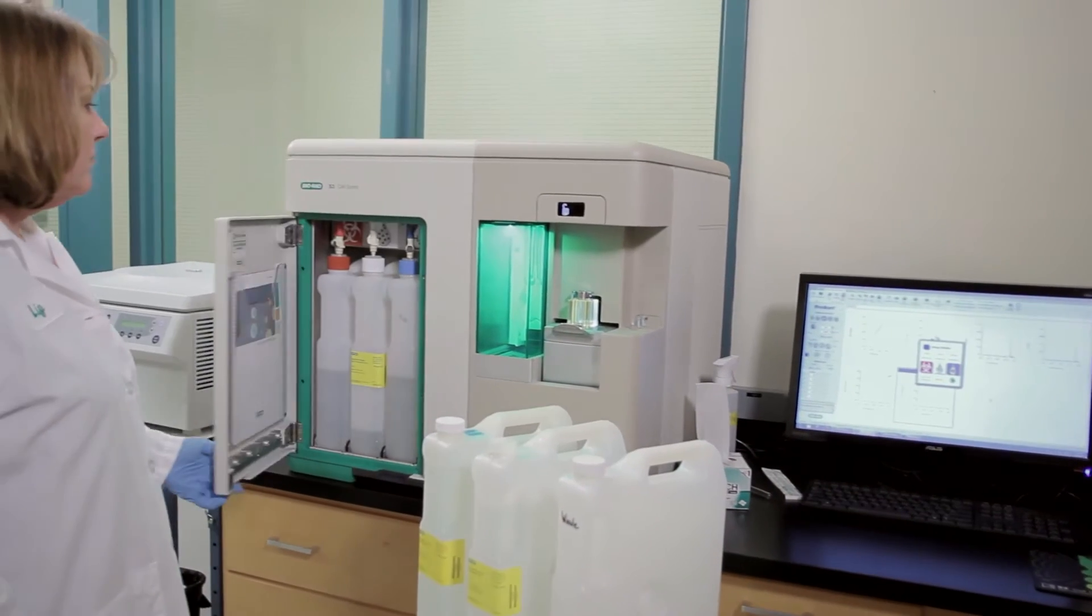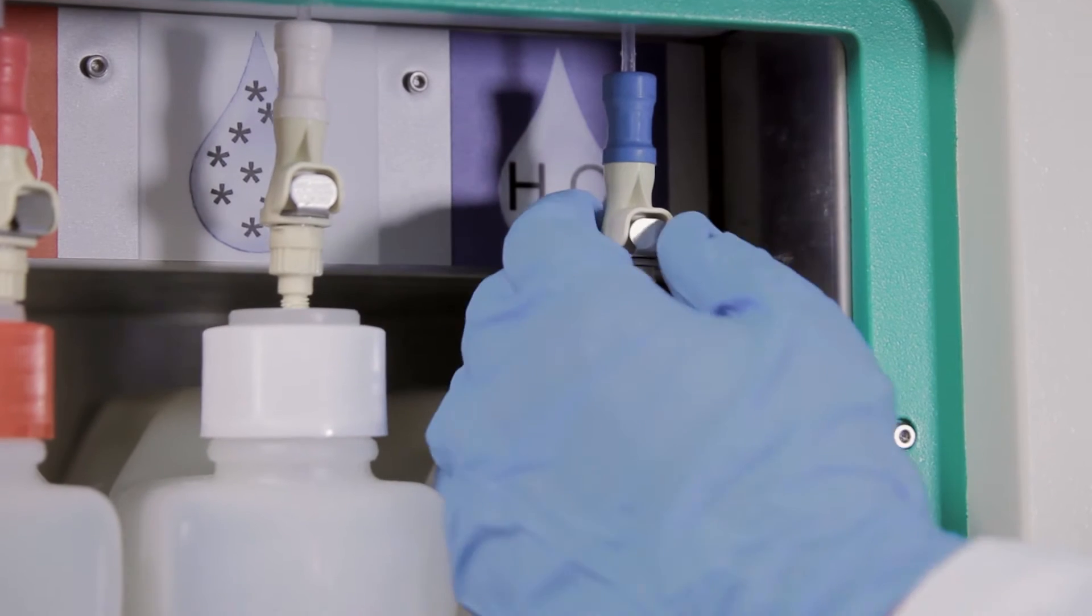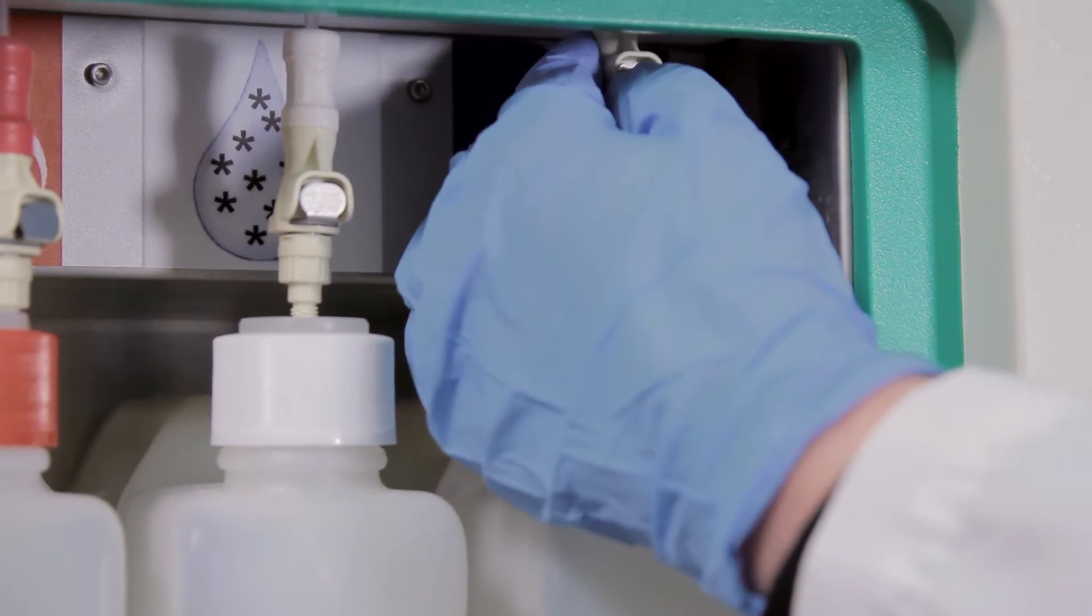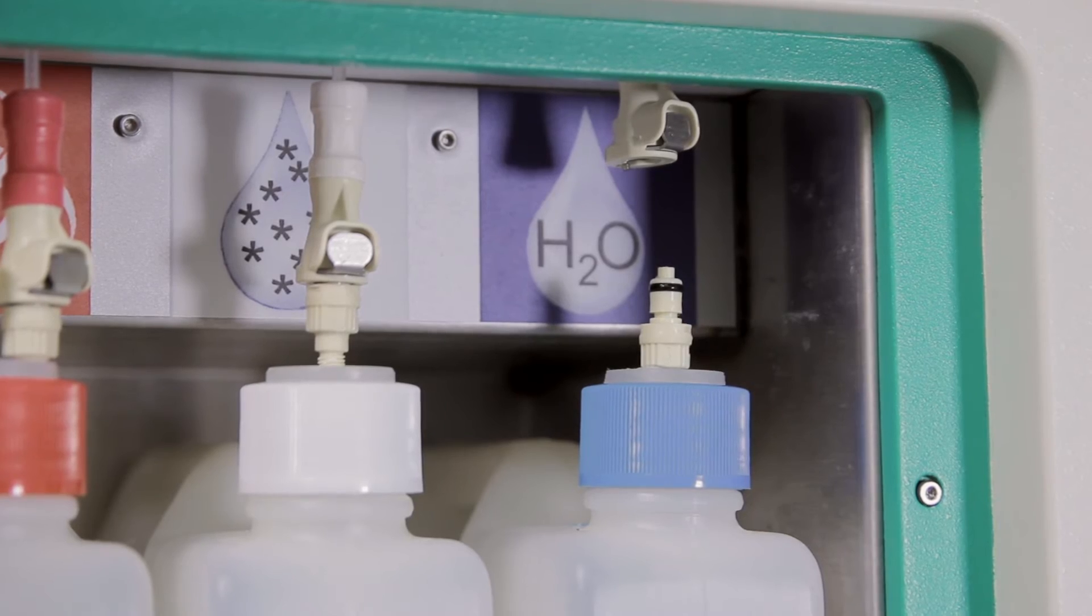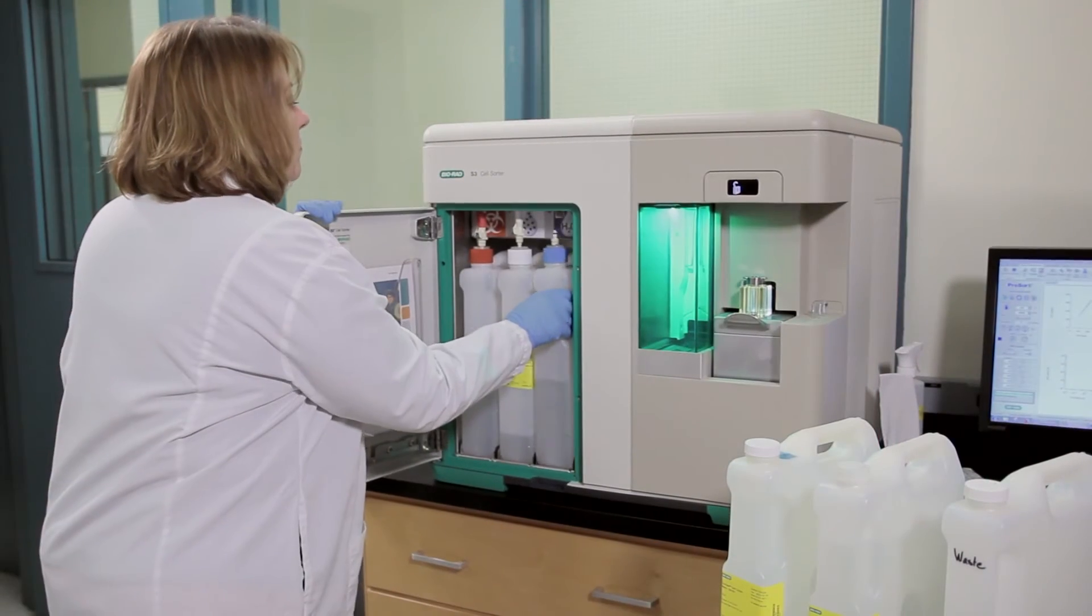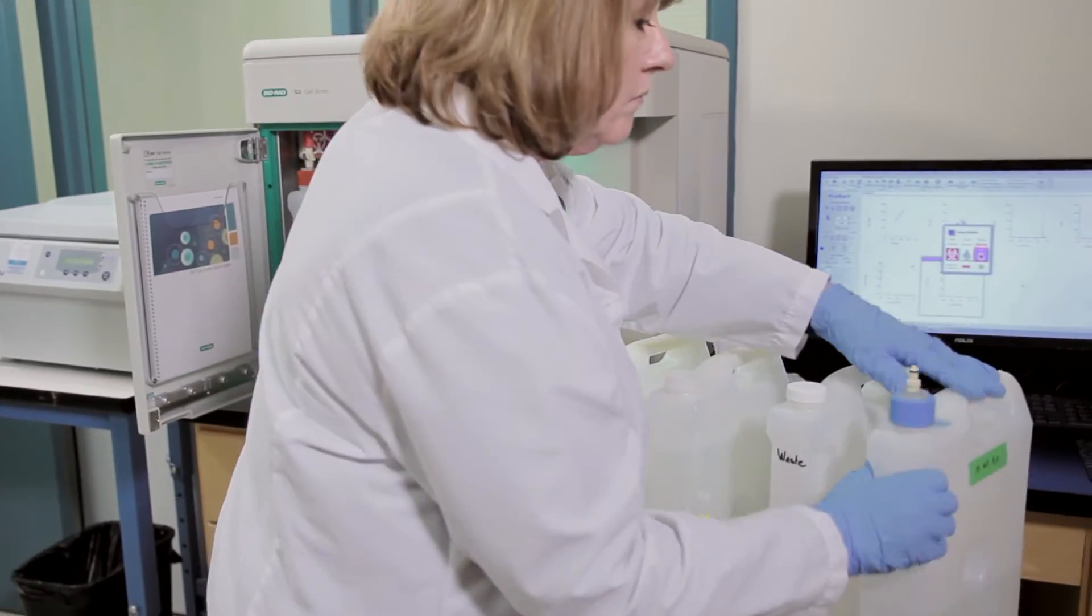Once your timer is running, open the fluidics door. Detach the quick disconnect from the cap assembly by pushing the metal button and then lift until it engages with the magnetic holder above the bottles. Gently lift up and pull out the empty container and remove the cap assembly.